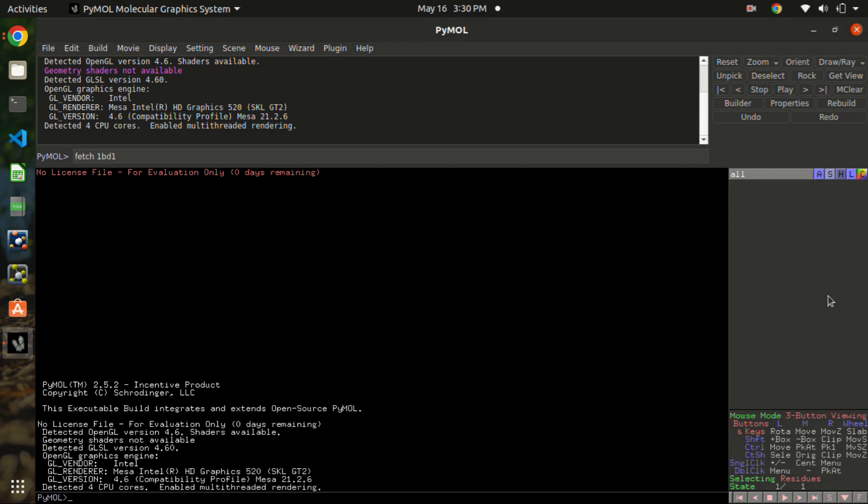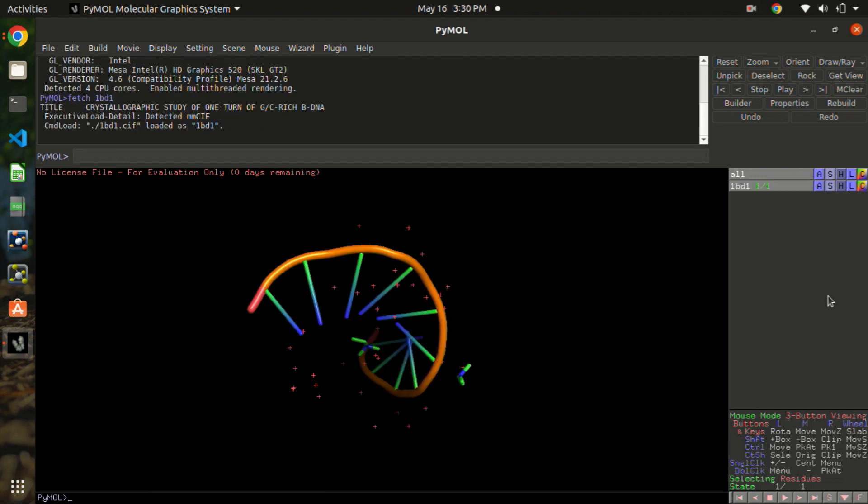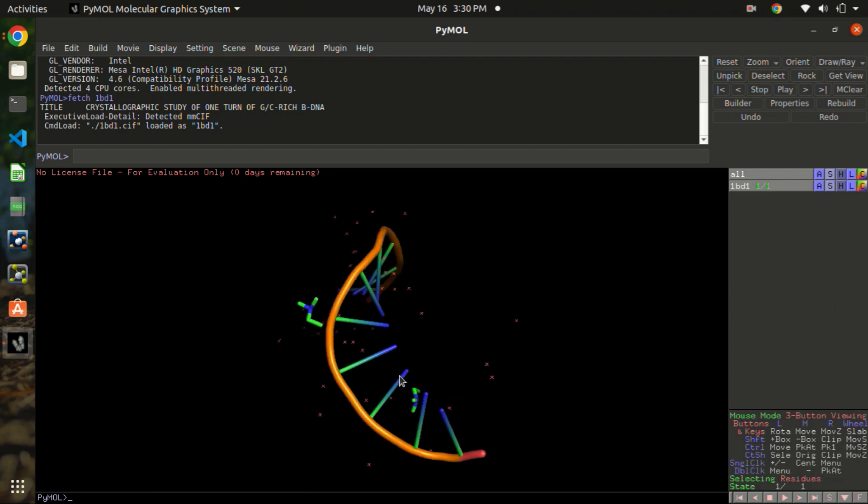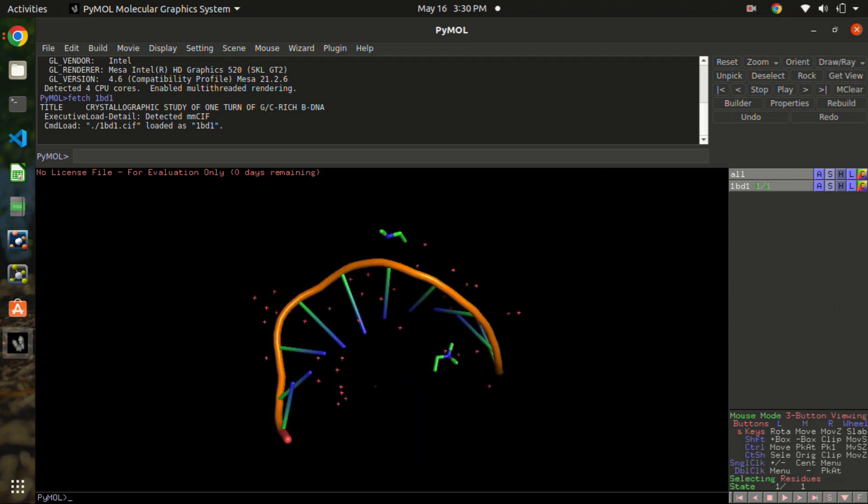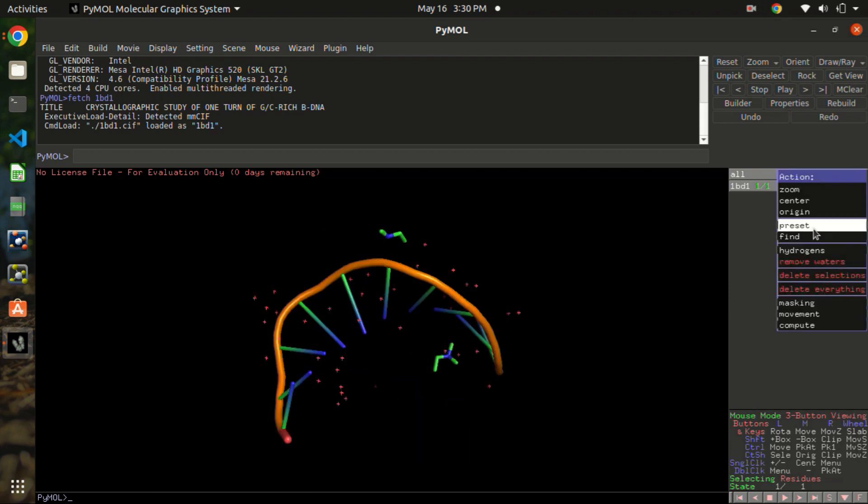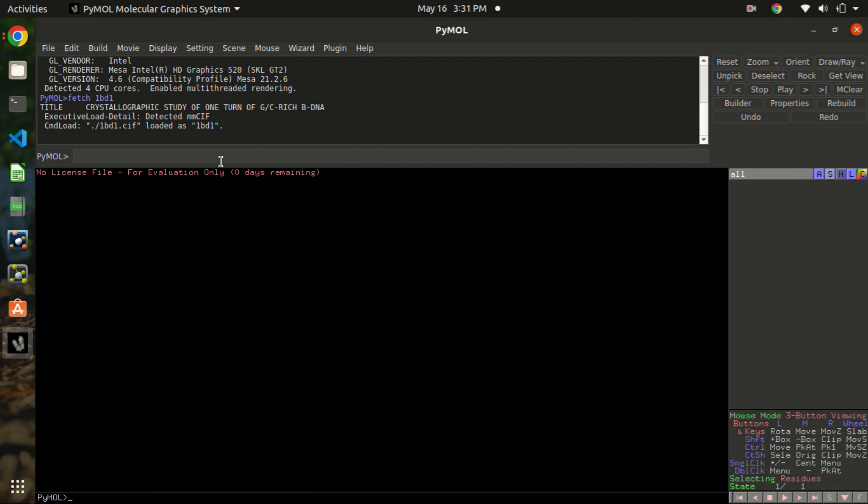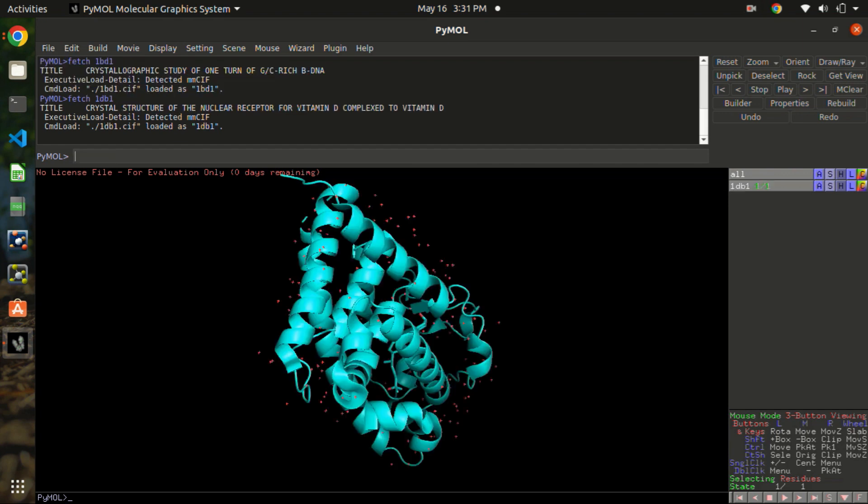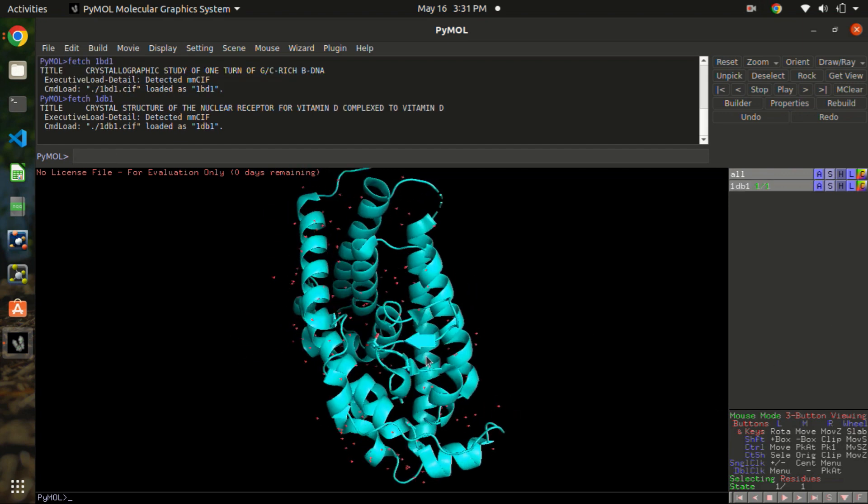Now it may take a few minutes or a few seconds. Oh no, it's not 1db1. Oh sorry, I misspelled something. Here it's fetch 1db1, I typed 1b1. Now that's the structure I wanted.